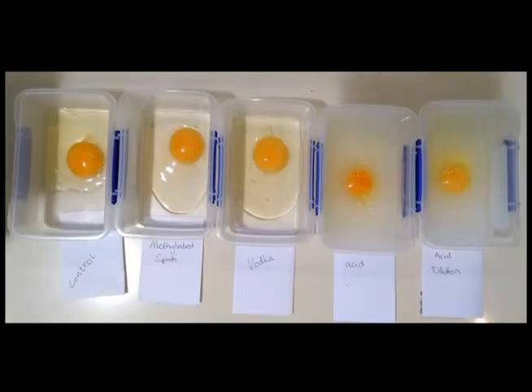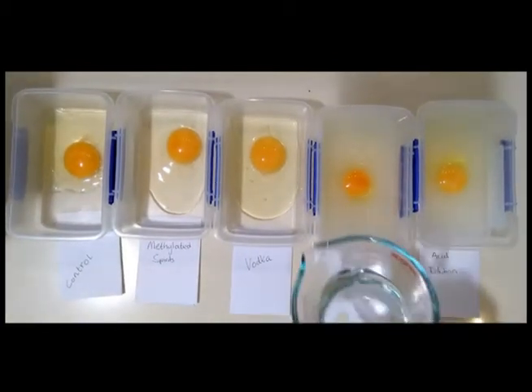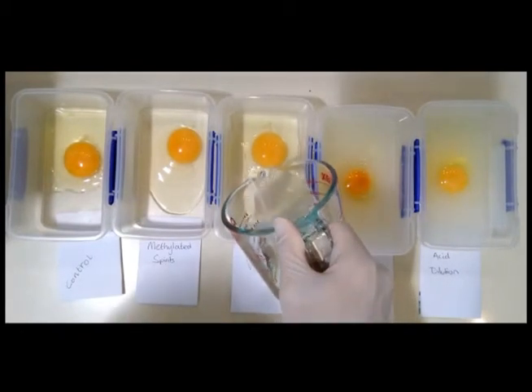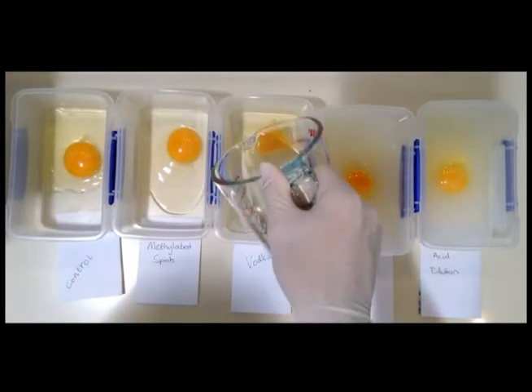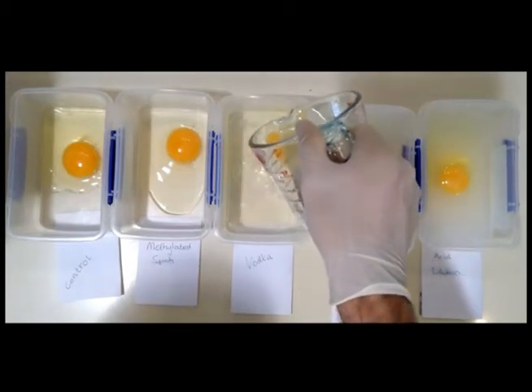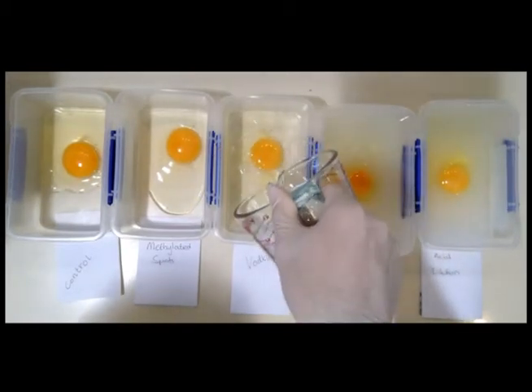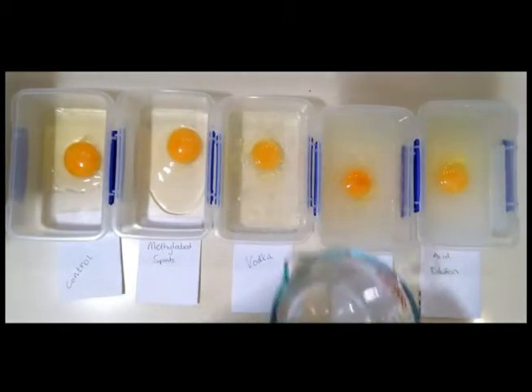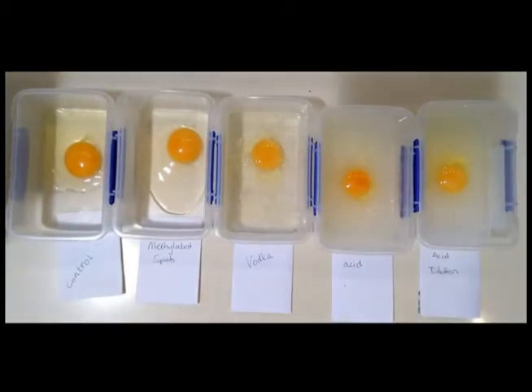Acidic pHs target the salt bridges in the tertiary structure of the protein, which are bonds between oppositely charged electrostatically attracted molecules. The citric acid, with a pH of around 2 to 3, causes straightening of the alpha helix or beta sheet, and hence the egg protein will have a slightly changed appearance, but not as dramatic as the previous tests.